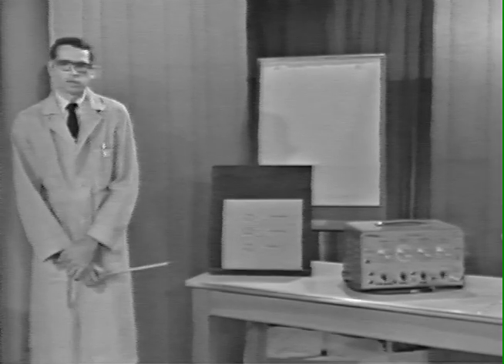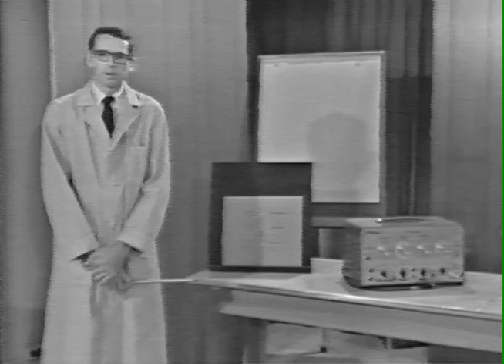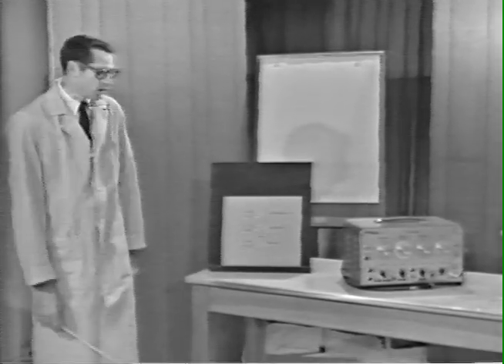In the second portion of the demonstration, we are going to be looking at some effects of sympathomimetic amines on the responses in the atria. We are also going to look at the effects of cocaine on these responses. Let's take a look at the drugs that we are going to be using.